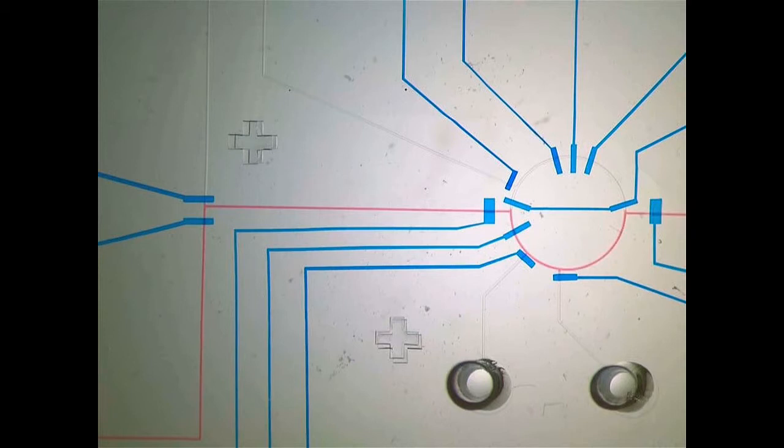Sample is loaded into the rotary mixer. Buffer is then loaded to replace the bottom half of the mixer.